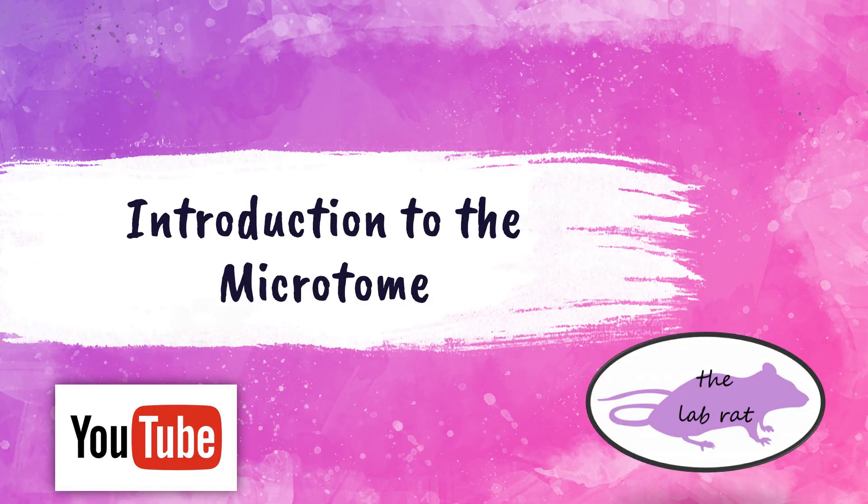Hey fellow Lab Rats, this is Rebecca from the LabRat YouTube channel. In this video I'm going to be discussing an introduction to the semi-automated microtome.